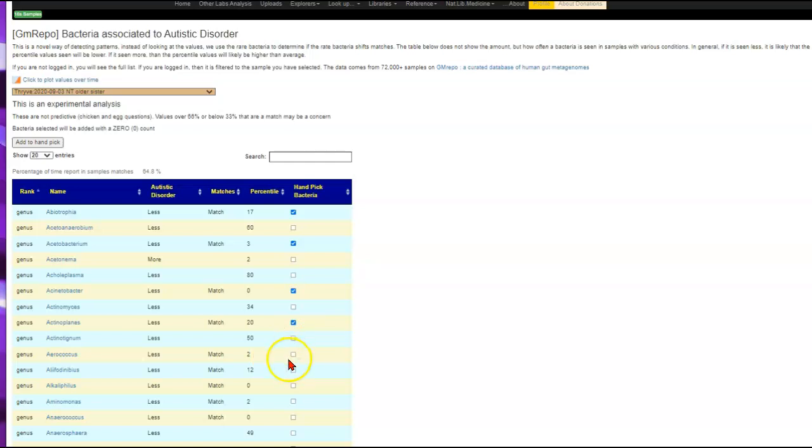Let's get that. Check, check, check, check. Excuse my sloppiness.